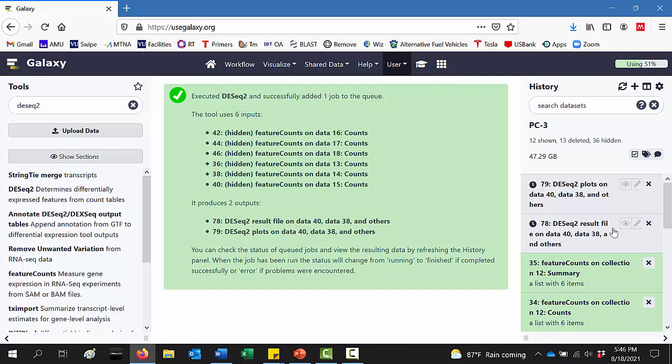I'm just going to let the video run here, but it really should only take a few minutes depending on how busy the server is. But feel free to pause the video and we'll come right back to it. Okay, so here we go.